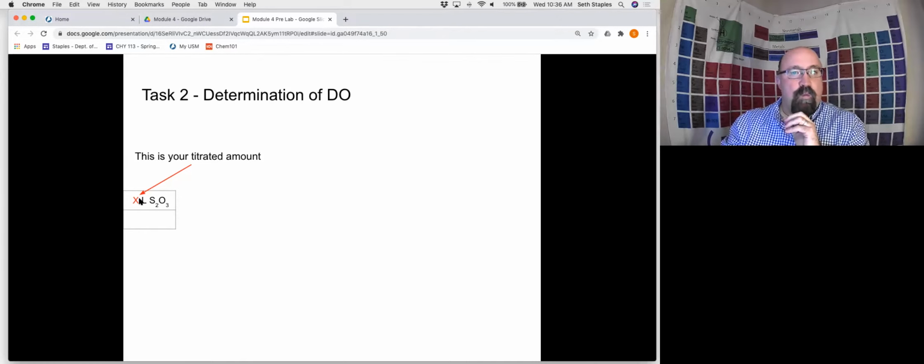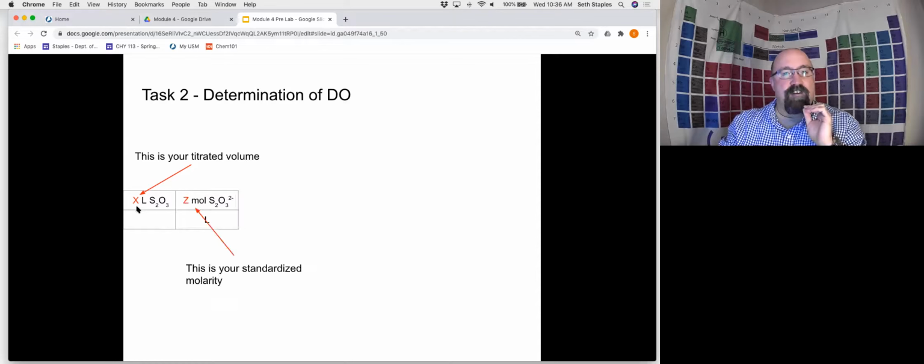And so in your determination of the dissolved oxygen, experimentally, you're just running a titration. And again, you're hopefully watching this pre-lab video before doing the lab. If you don't understand what a titration is, that's fine. You will. That's one of the things that your instructor will be talking about, what a titration is and exactly how you do it. This is just the background information, getting you ready. And so you're going to perform your titration, and from that, you're going to have a volume.